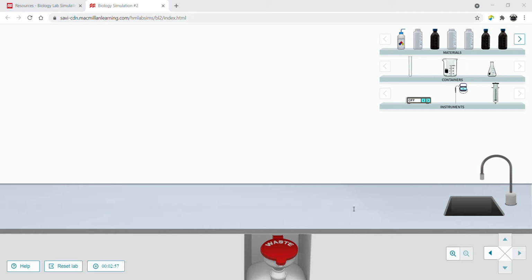For starches, which doesn't have its own header, maybe I'll change that on your handout, there's another carbohydrate called a starch. A starch is a really big molecule, lots of glucoses strung together, thousands, if not tens of thousands. There's another test that would indicate the presence of starch.